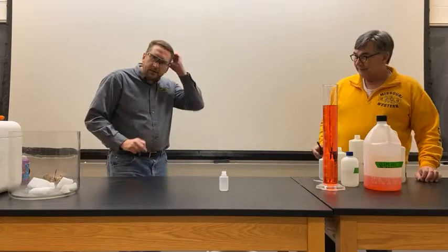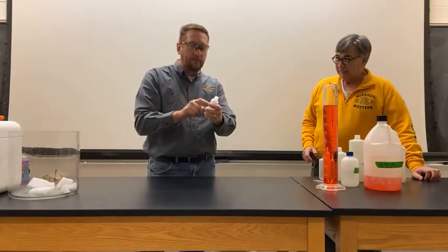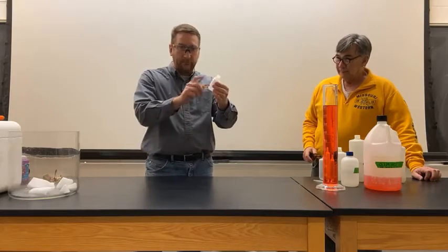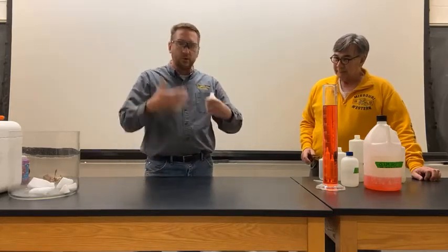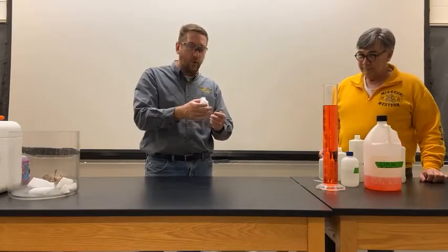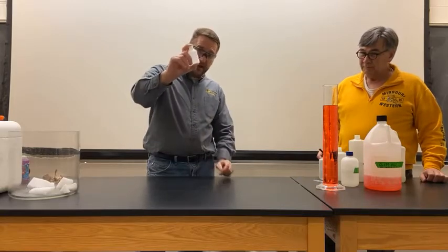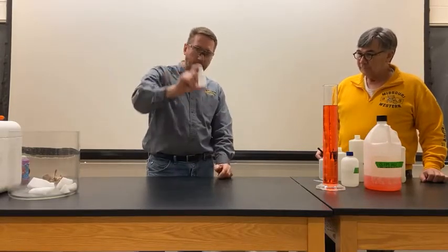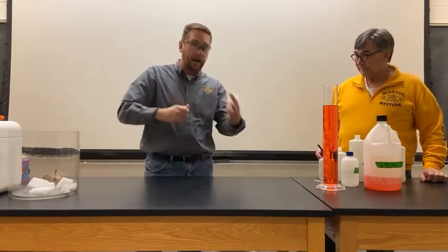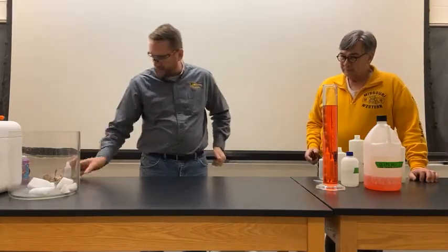Okay, there you go. So you saw a little pop, right? That little pop was the ignition of the ethanol vapor that was in this bottle. Now, of course, when we power our vehicles, we use that quick expansion of the gas to power our cars. But one of the things that happened when we burned ethanol is we get carbon dioxide and water as the results of that combustion reaction.